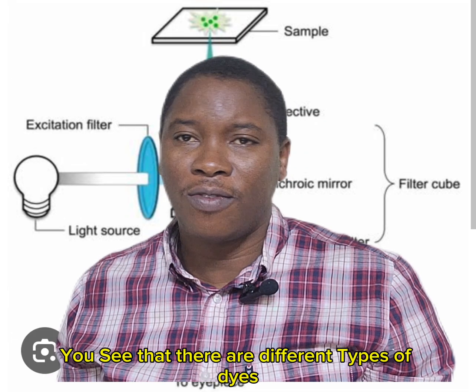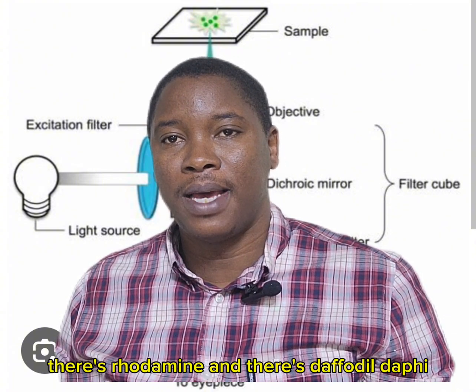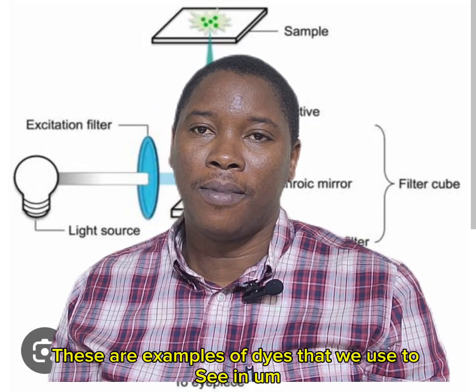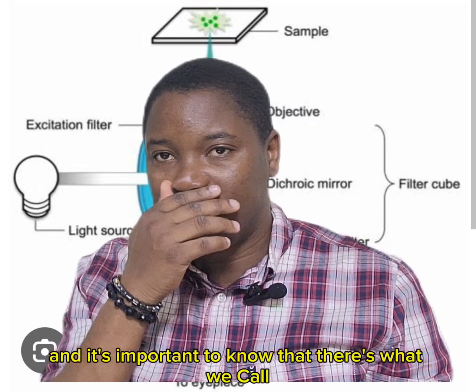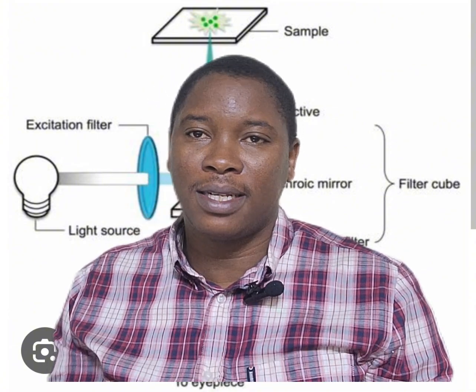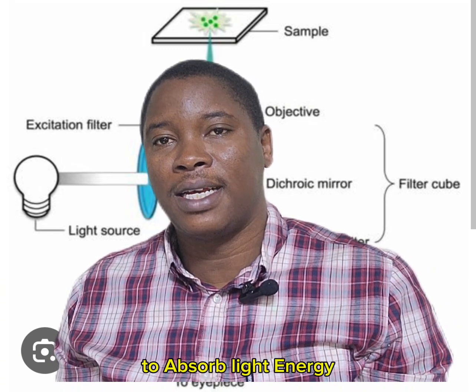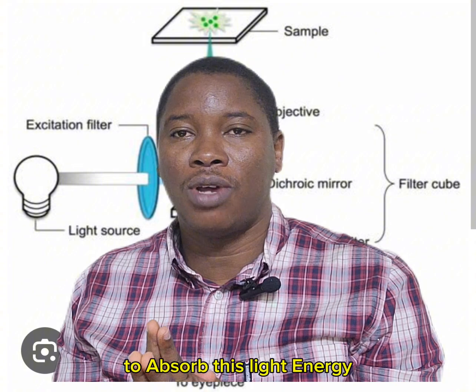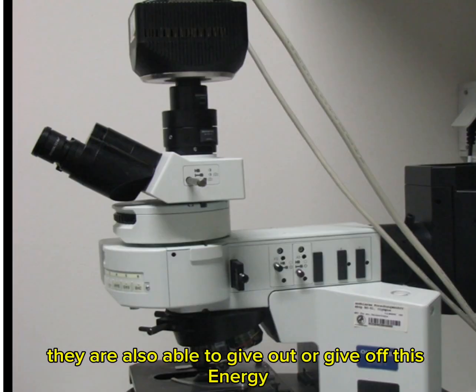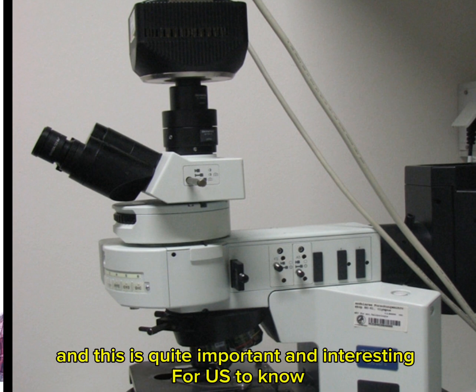There are different types of fluorescence dyes. There's rhodamine and there is DAPI. These are examples of dyes that we use to stain different cells and structures. And it's important to know that there are what we call fluorophores. These fluorophores are components present within the cell that have the capacity to absorb light energy. Not only can they absorb this light energy, they are also able to give off this energy in the form of a glow. And this is quite important and interesting for us to know.